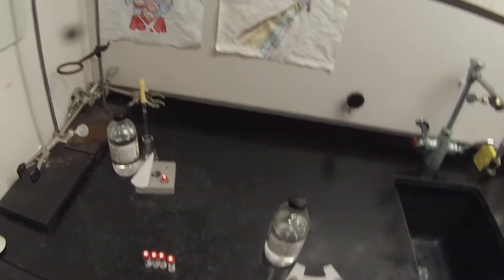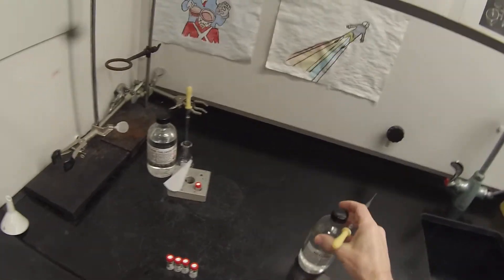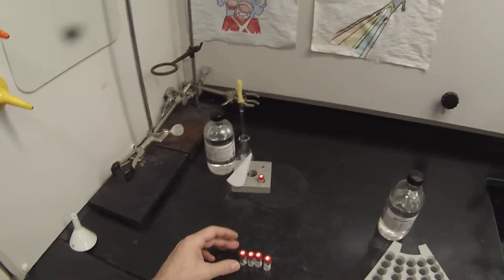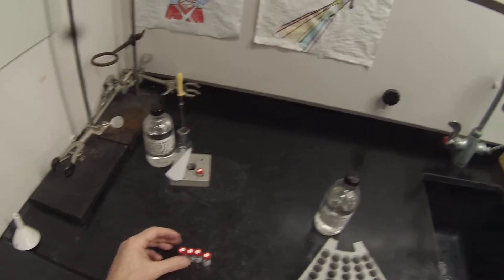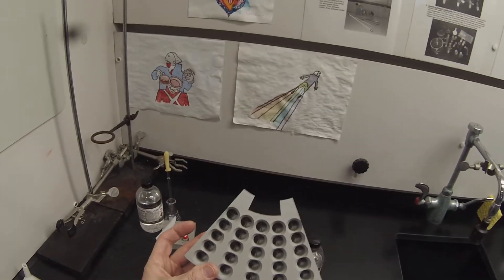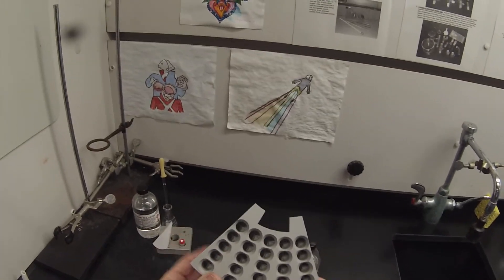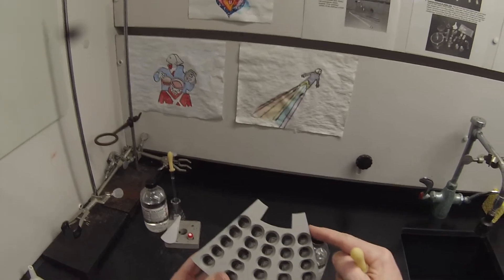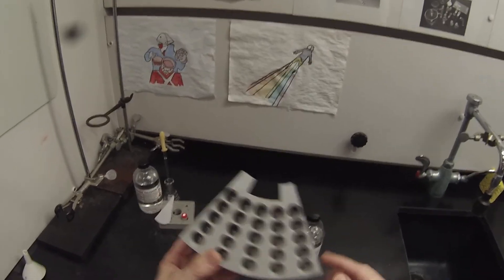We're going to gather some GC mass spec data on the various products from the Bromination Lab. So I've gathered one of these GC mass spec sample racks, starting with one here through five.